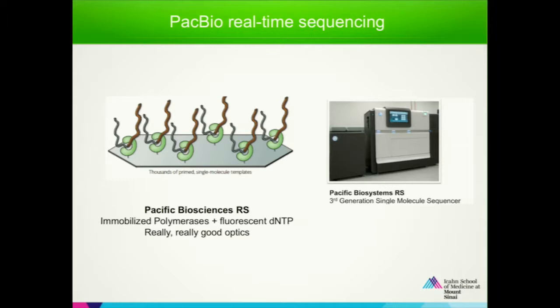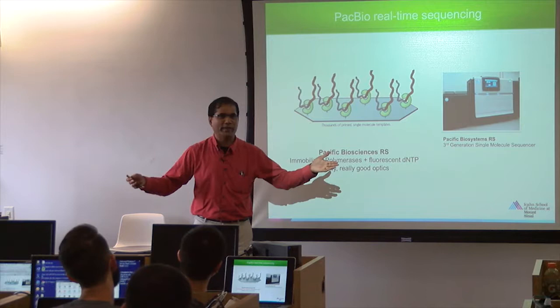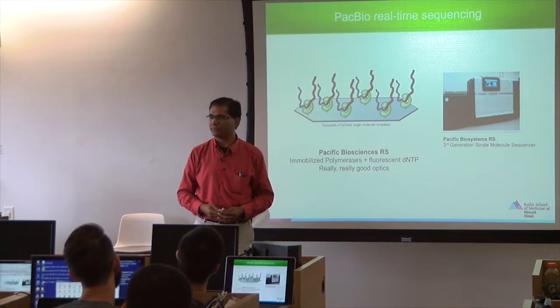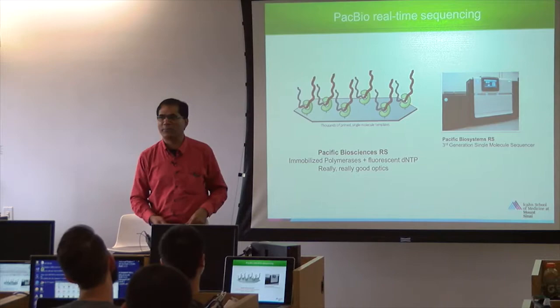Protein immobilization, has anybody heard? It's a very fascinating field. Enzyme immobilization. You do enzyme immobilization in industrial enzymology. In industrial reactions, if you do big enzymatic reactions to develop some biochemical compounds, you do enzyme immobilization. Okay? So you use that immobilization technique here. Immobilize the enzyme and then put the DNA adducts here, start the reaction, and then keep measuring it.